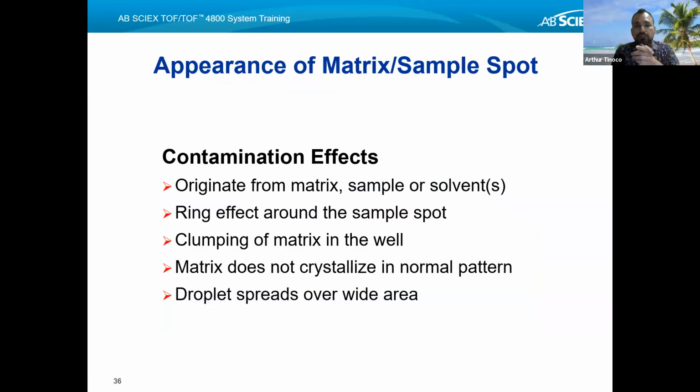We can give you some pointers on where you should buy matrix from, if you're going to buy it. The matrix that we'll be using are ones that have been extensively used, and I know that there should not be a problem. The next thing, as I mentioned to you, is the solvent. As long as you follow the criteria of at least HPLC grade solvent, you should be okay in terms of the prep of the MALDI solvents themselves.